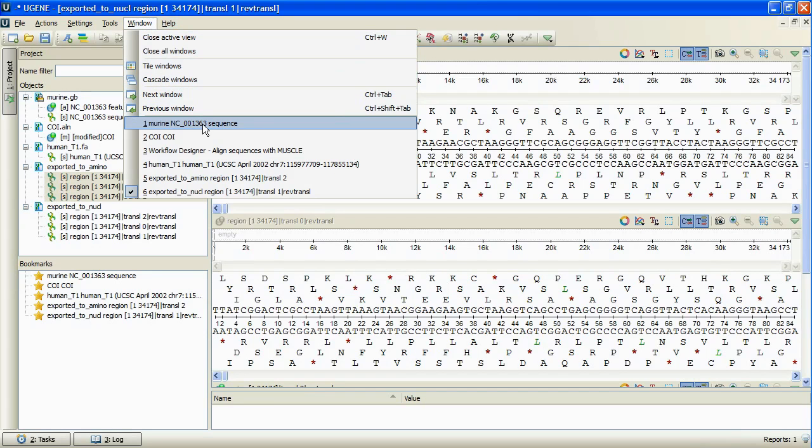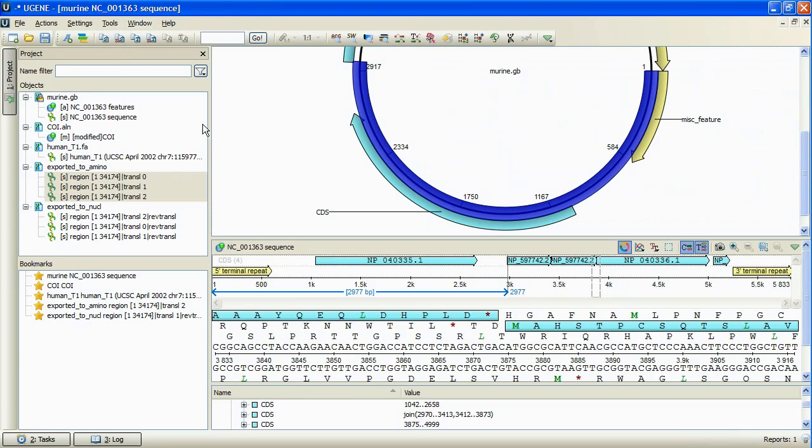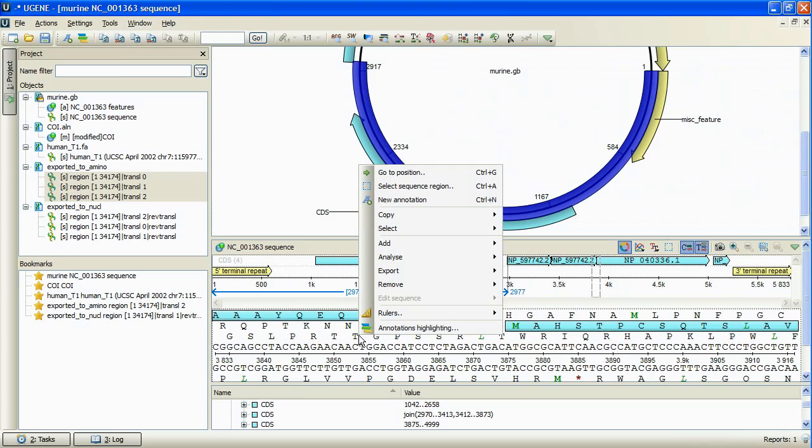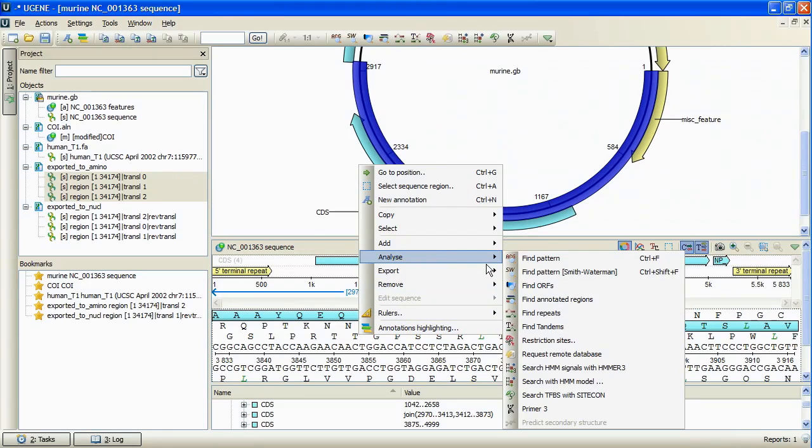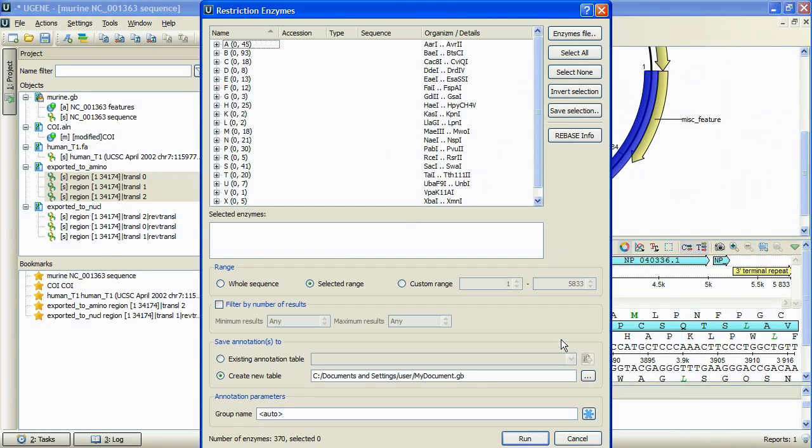Yet another change concerns the restriction enzymes plugin. Let's activate the open gene bank sequence view by selecting it in the windows program menu. We bring up the context menu and activate the restriction sites search.